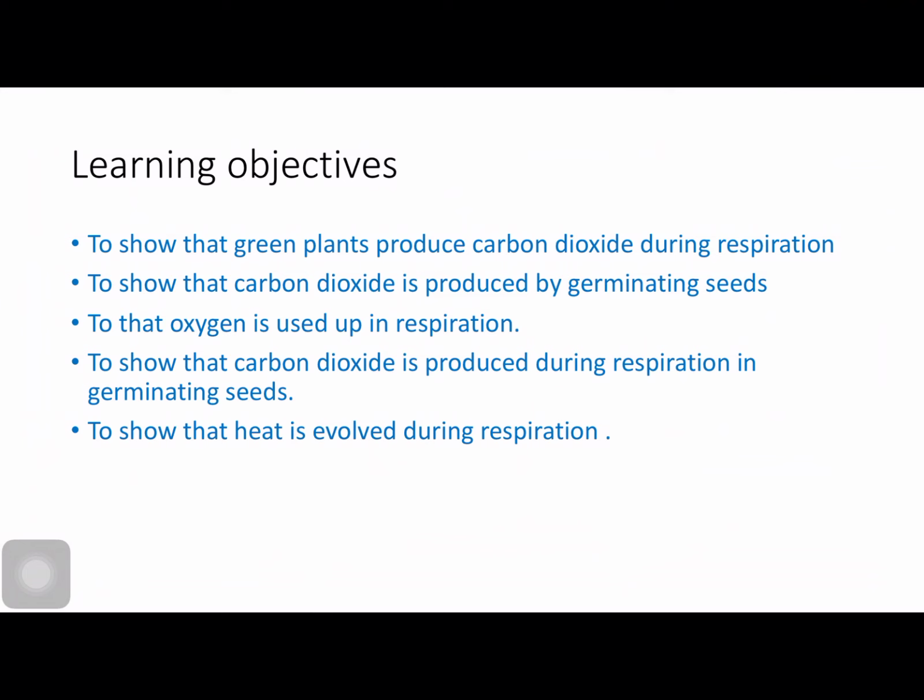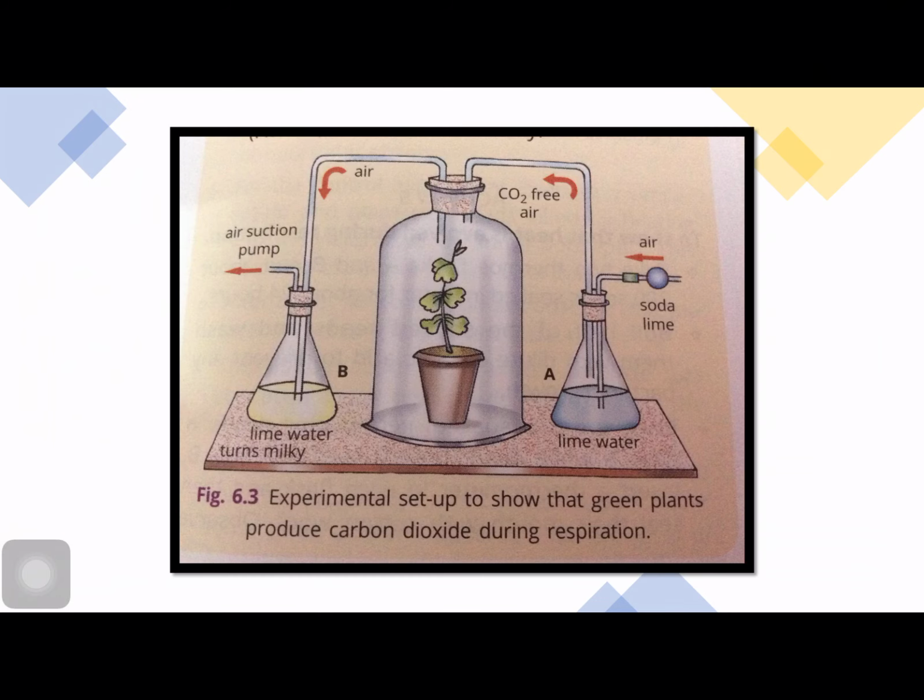And last but not the least, we will see that heat is evolved during respiration. So these 5 experiments we are going to deal with today. Now let us start with the first experiment.